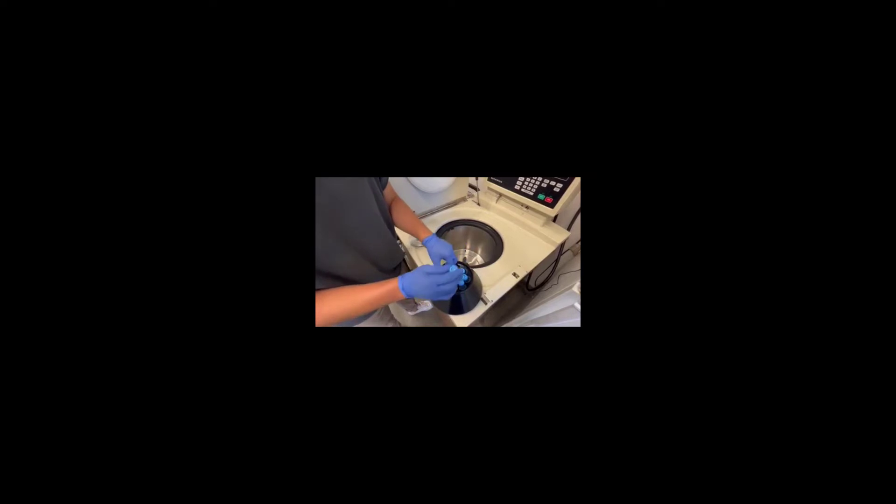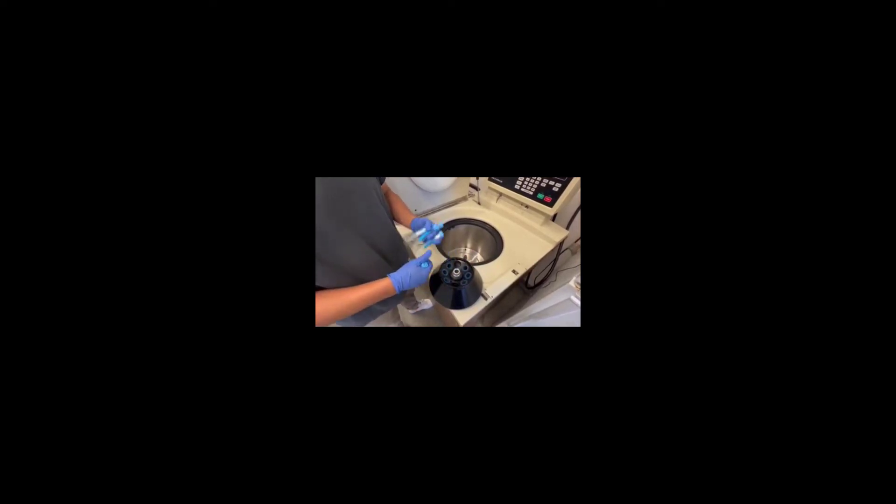Inside your rotor here is where the centrifuge tubes go. Something very important, and probably the most important thing to emphasize with centrifugation, is that you're going to need your weight to be evenly divided. So if you have an odd number of samples, you're going to need to fill up a blank to hold that weight in there.